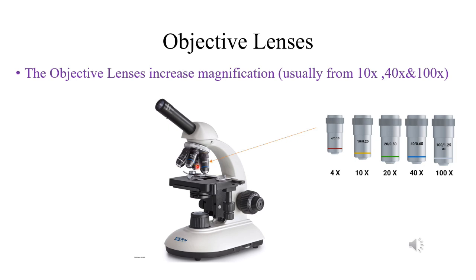In a compound microscope, we use different types of objective lens depending upon the magnification we need. And in the microscope here we use 4x, 10x, 20x, 40x, and 100x. And this objective lens is present in the nose piece. By rotating the nose piece, we can change the magnification of the objective lens.